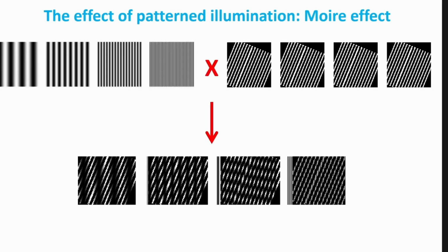This basically means that if I take this illumination pattern and I have these samples which I drew before, you saw that these two are already outside the yellow circle. They were not resolved by the microscope. But now if I illuminate these with such a light field, this is what I will get.